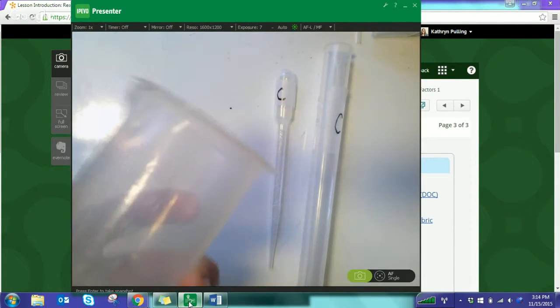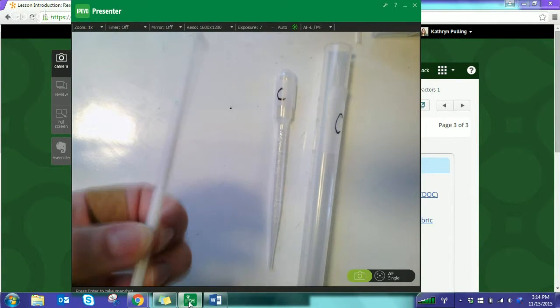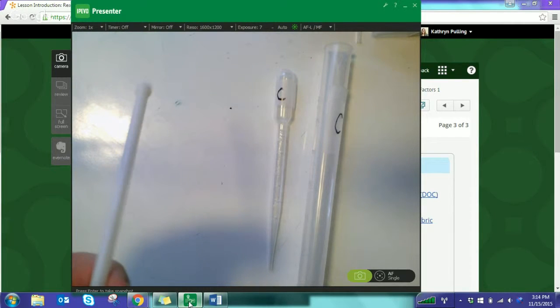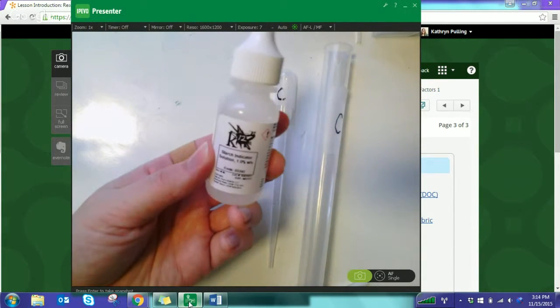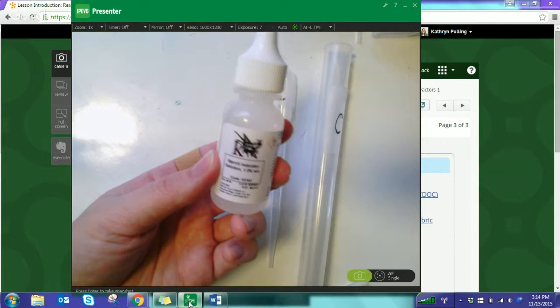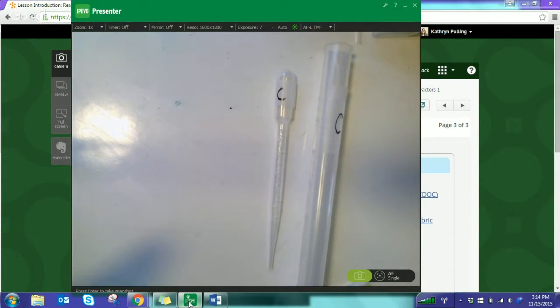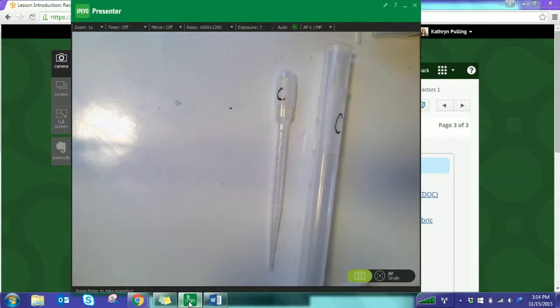Then you're also going to need one of the smaller 100 milliliter beakers. This is what we're going to run all the reactions in. You're going to want a stirring rod. This comes in a pack of 3. You only need one of them. You're just going to have to wash it off in between. You also need this starch indicator. It looks a little bit different than the picture in the book, but it's starch indicator solution 1%. Once you have all of your materials set, you have everything labeled with the different letters so that we're not going to contaminate everything.